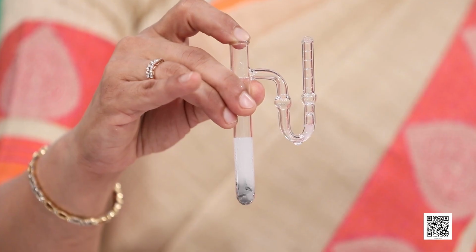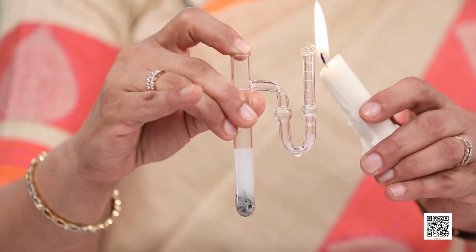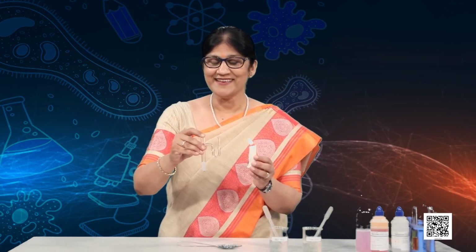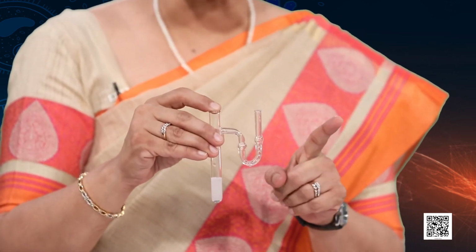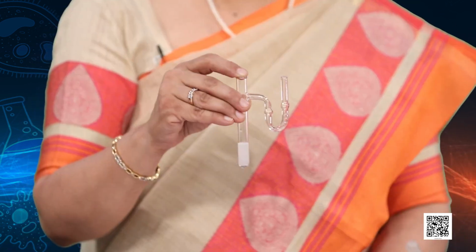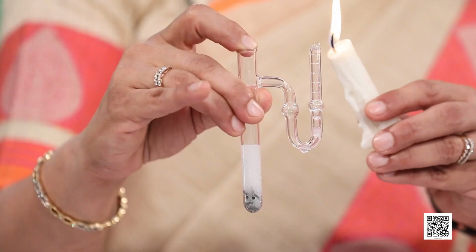What is happening? This bubble is rising, and now let us test these bubbles with the burning candle. So, did you hear that pop sound? Yes. This means that this gas, which is a colorless gas, is hydrogen gas. Why should you agree to what I said? If I say it is the hydrogen gas that is evolving, a scientist always has to question. You have to question me that how do you say, ma'am, that this is hydrogen gas? Then I will tell you that the gas is colorless, you can't see any color, and because this gas is burning with a pop sound, it is the property of hydrogen gas.